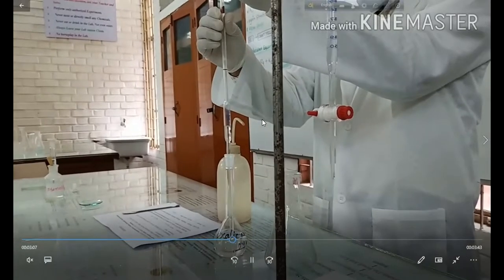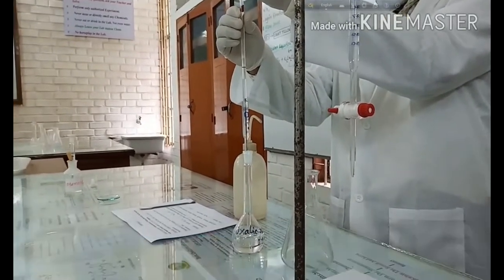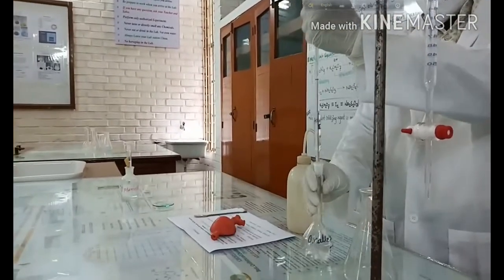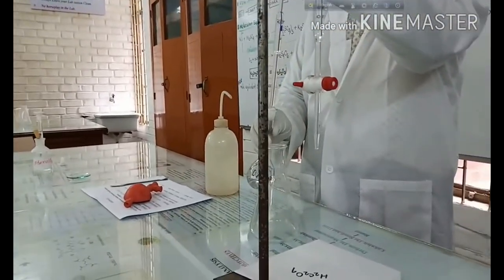so that we can also compare how much error came in our work. So now we are taking 10 ml of oxalic acid by using the pipette and pipette filler.